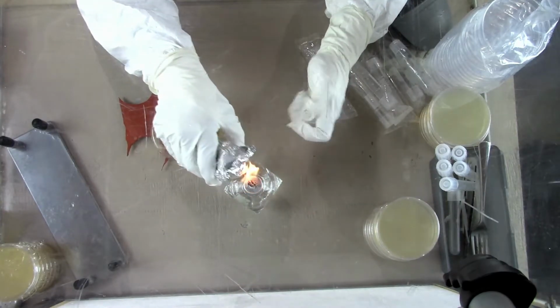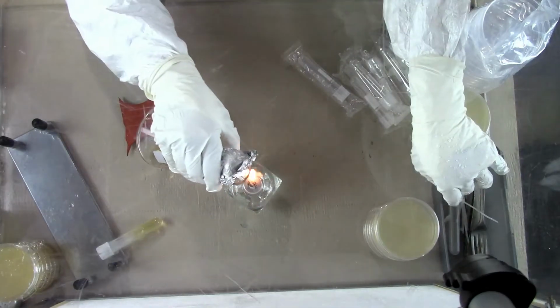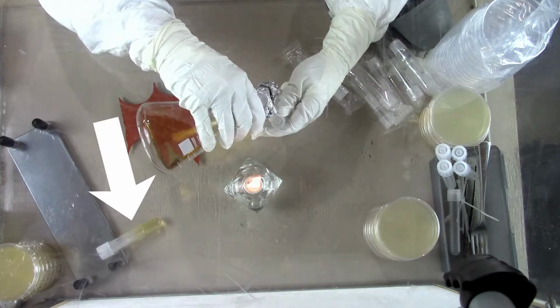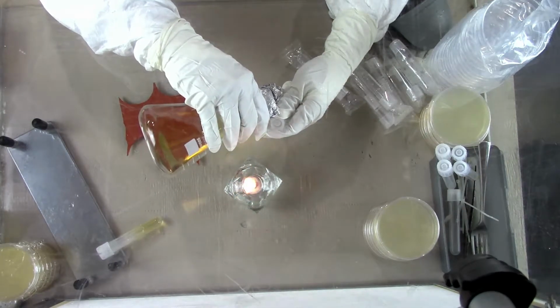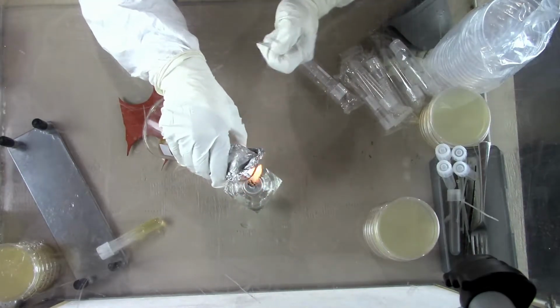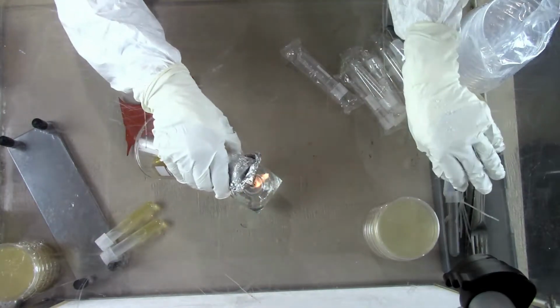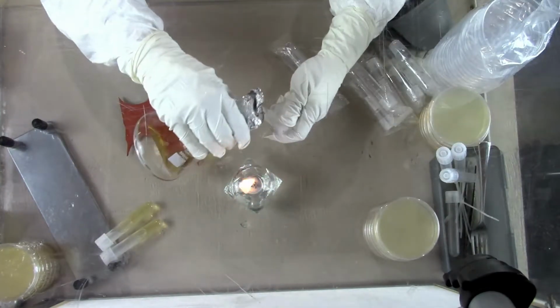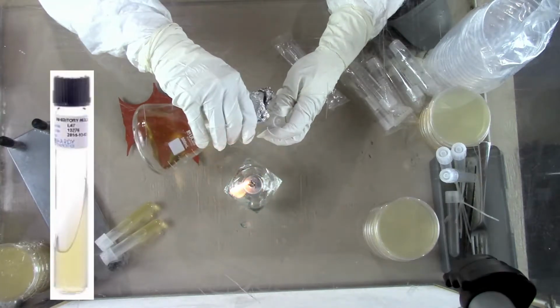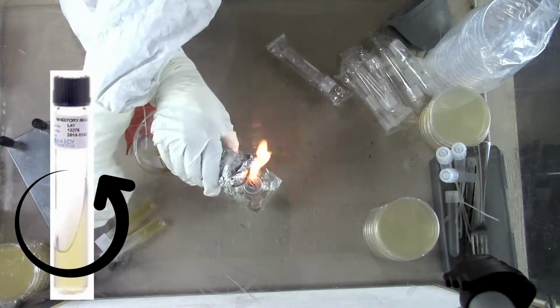After you pour, you close the tubes, and as you see there, I inclined those, that way they form that slanted portion, and when it gets solid, you will have slanted tubes. I did the same thing here, so you can see over there that they are slanted, so you create that surface in that tube where you can inoculate your bacteria.